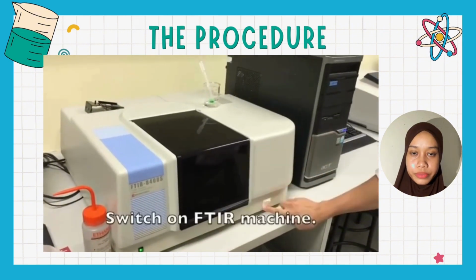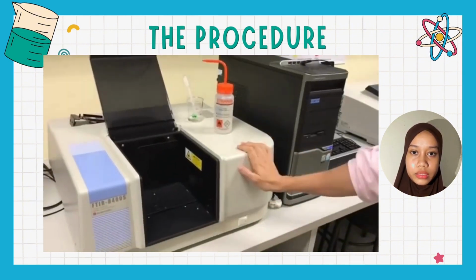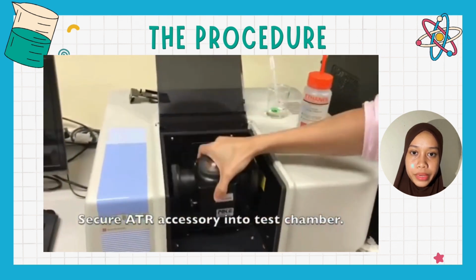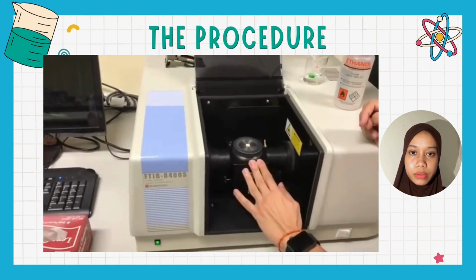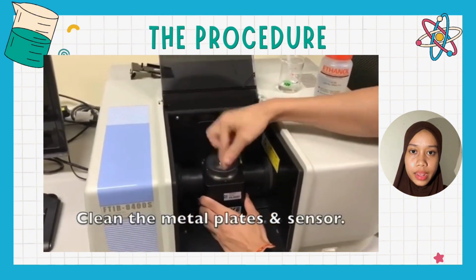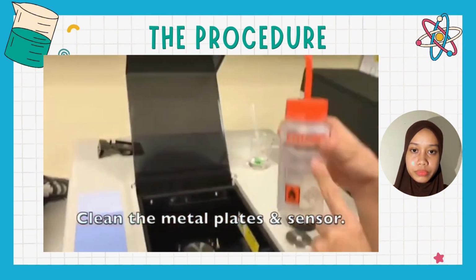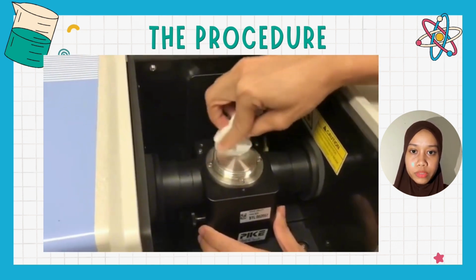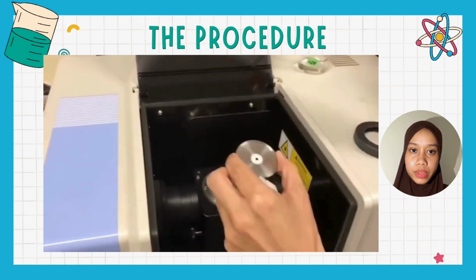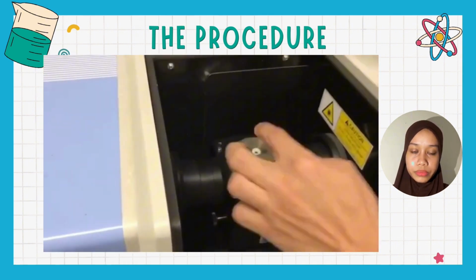Next, the procedure. First, sample preparation. Ensure the sample is dry and clean. Place the sample on a diamond plate or in an appropriate holder. Number 2 is machine setup. First, turn on the machine and the computer. After that, open the FTIR software on the computer. Next, sample measurements. Position the sample for measurements. Run the spectrum analysis through the software. Wait for the sample spectrum to be obtained.